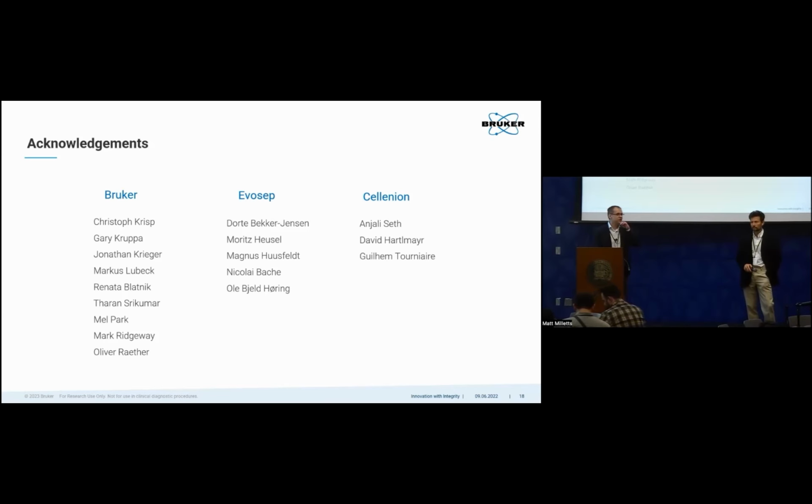Okay, good question. Your first question was about when you go to multiple cells, do you see an increase? You do, to a point. Nikolai probably has a better idea of this than me, but once you get past about 100 cells or so, then at 1,000 cells, you start to see it falling off in that respect.